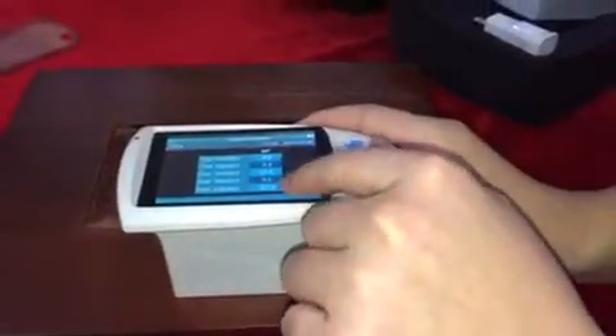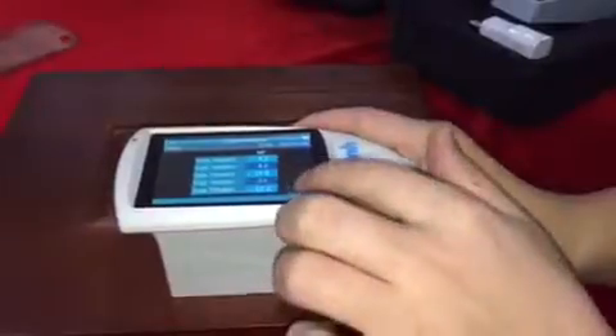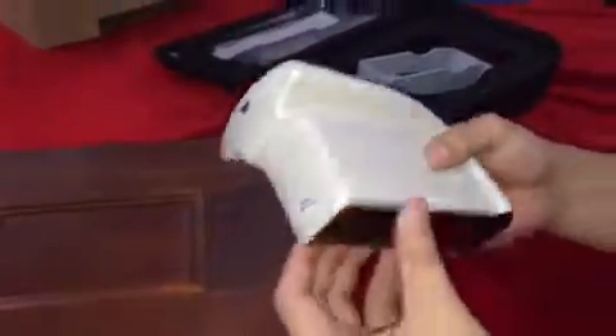The measurement result will show here. Okay, that's all.